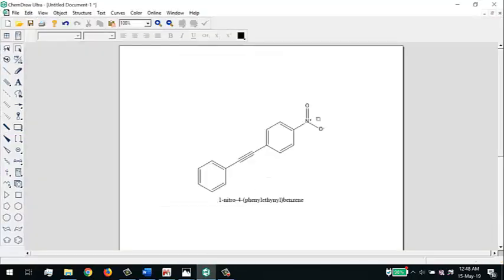And this is where the symmetry of the molecule comes into play. So 4.5 times 2 is 9, because of the symmetry, this proton is identical to this, this is identical to this, and this one is a single proton by its own.